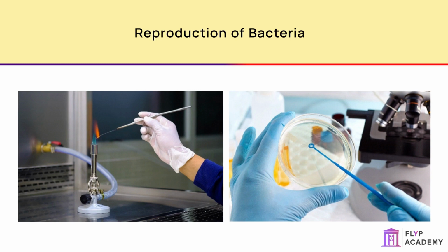Next, seal the lid onto your Petri dish with 2 short lengths of tape. But make sure you leave some gaps for oxygen to enter. You will then need to incubate the sample to allow the bacteria colony to grow. In schools, bacteria is incubated at about 20 degrees centigrade. This is below human body temperature. This is so that no bacteria that could be harmful to us is grown.